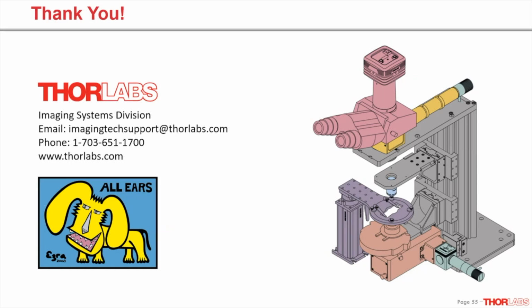You can do reflection DIC. I don't know if there's a difference between the two light sources and how they perform. Unfortunately, I don't know enough about the difference of those light sources. You basically just need a polarized beam, so both of those you can collimate and then polarize. So I actually don't know whether one would be more advantageous over the other. Henry, do you know? No, I have no idea.